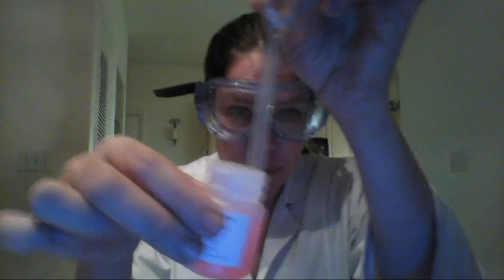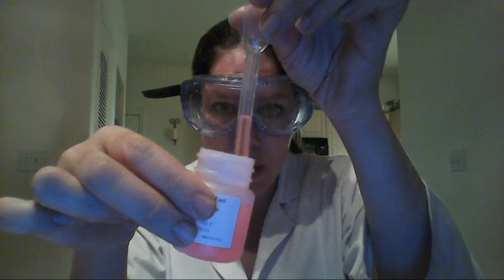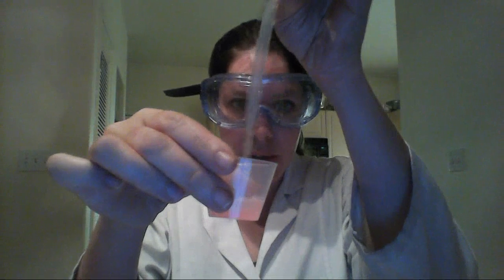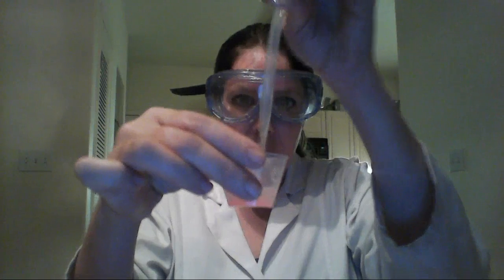Okay, and remember how to do this. You squeeze it, stick it in the solution, slowly draw it up until you get to 2 milliliters and then kind of stop squeezing so that you hold it there. And now you're just going to transfer it directly into the medicine cup. Okay, and if you keep this squeezed, you can even use it to stir a little bit. Okay, and squeeze it out.